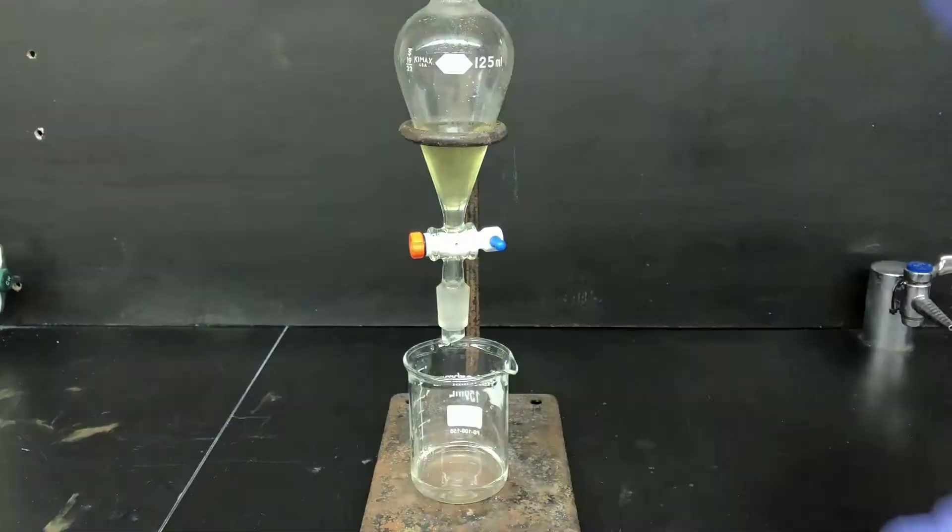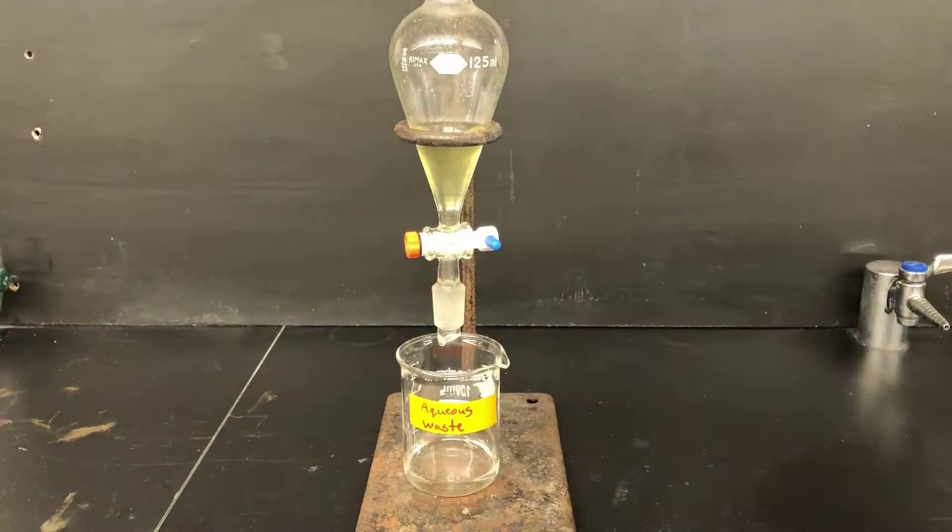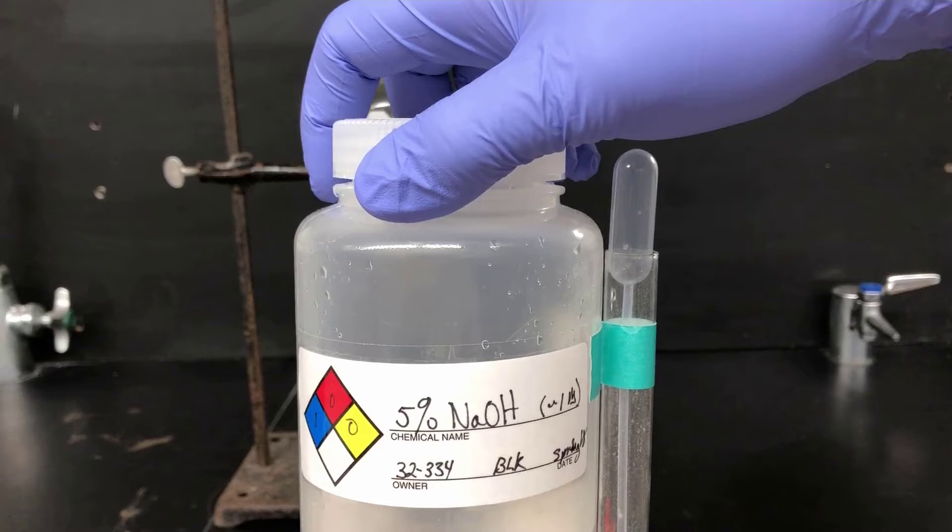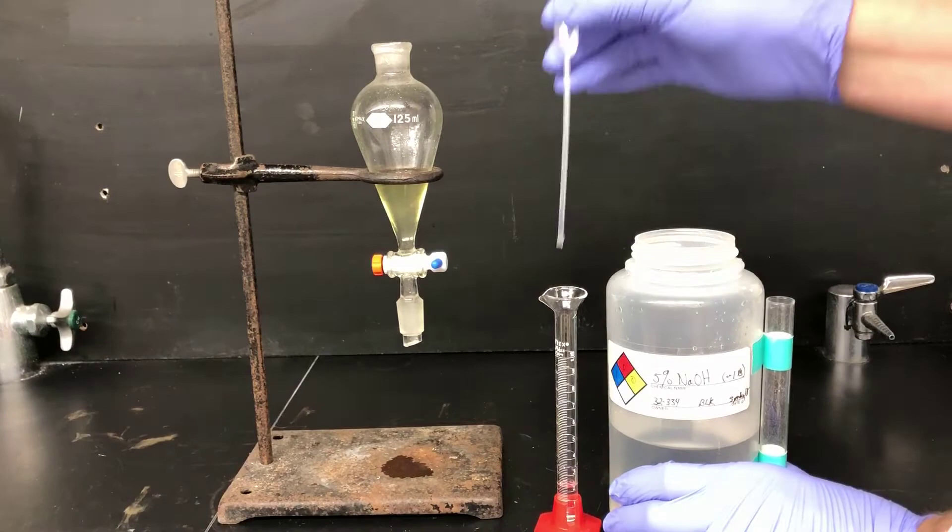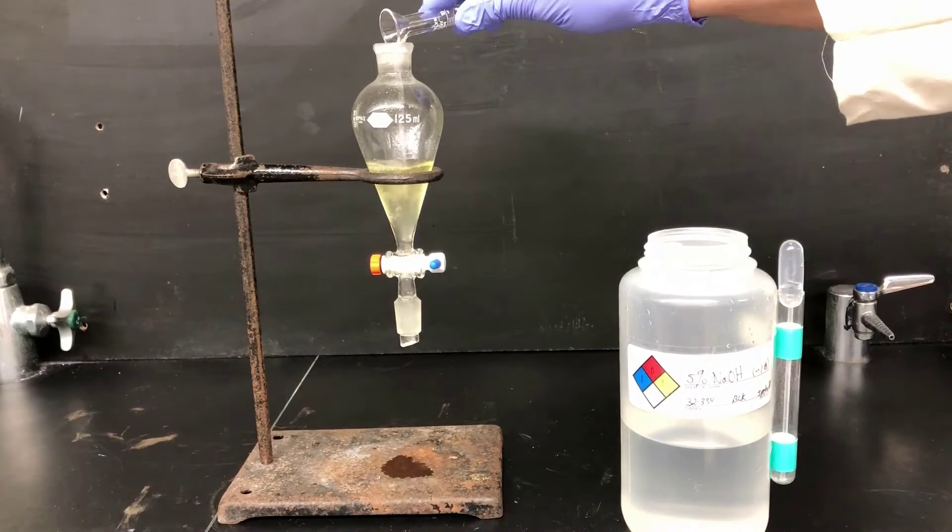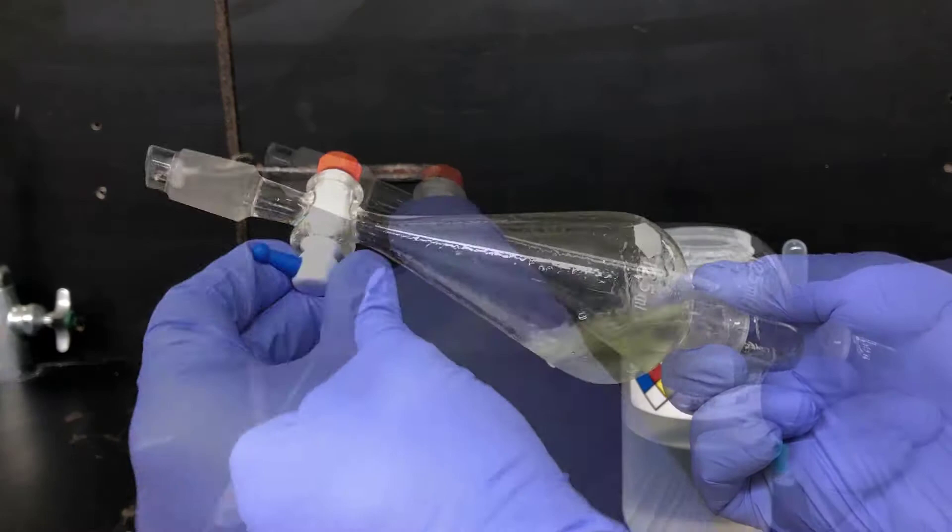To separate benzoic acid from the other organic impurities, I'm going to be extracting it using 5% aqueous NaOH, sodium hydroxide. I'm measuring out 8 milliliters of this solution, which I'll add to the separatory funnel, and then shake. Sodium hydroxide is a base that will deprotonate benzoic acid, making it into a much more polar sodium salt, so it'll migrate out of the organic layer, away from the organic impurities, and into the water layer.